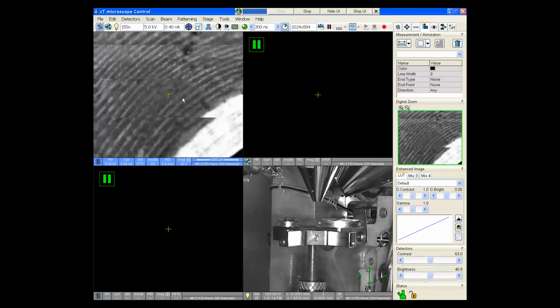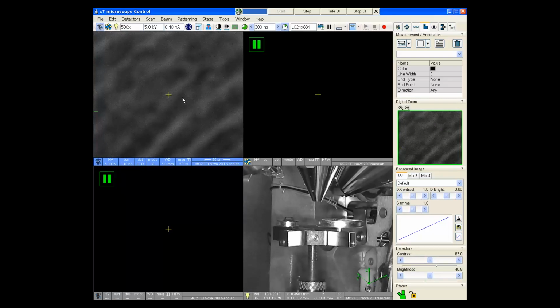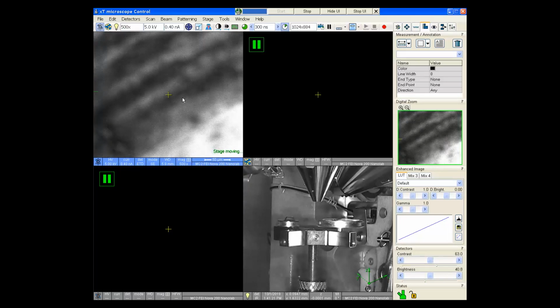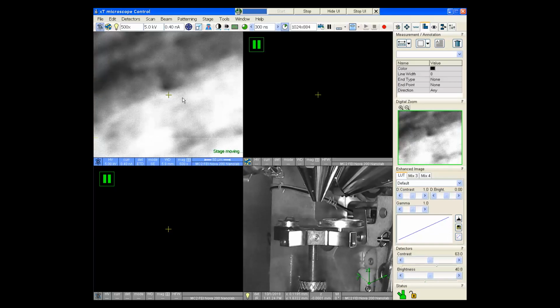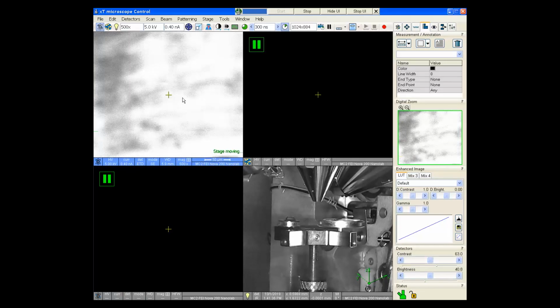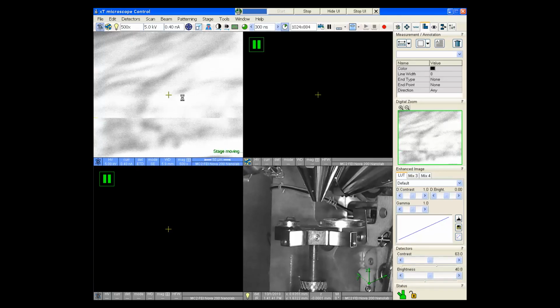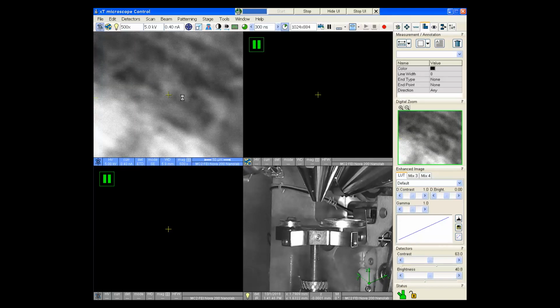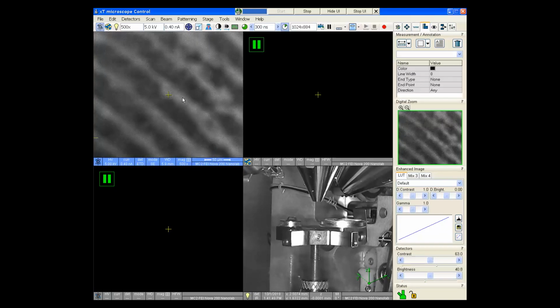So if I turn the magnification knob to a higher value and now push the arrow keys, the stage will still move by approximately 80% of the field of view every time I push this. If you're using the arrow keys, keep in mind that the microscope software does not react well to pushing the arrow keys very quickly. If I push the arrow keys multiple times in a row, the stage generally moves just once. If I hold the arrow keys down, the stage will move in a rather chaotic fashion and can be very difficult to actually stop, especially at very low magnification.